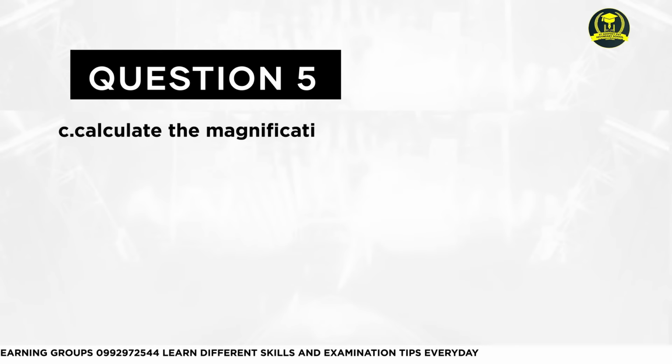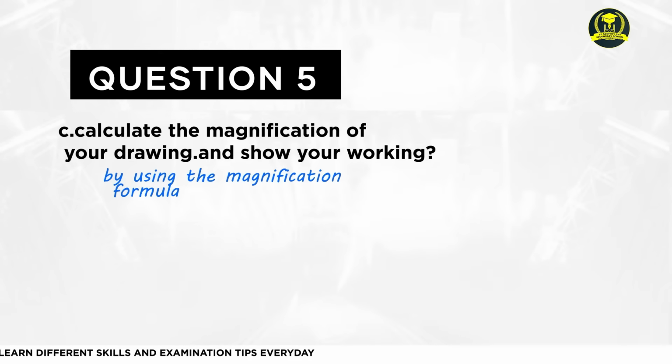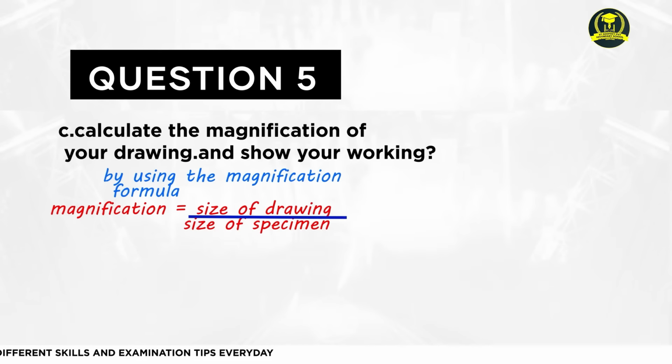Question C. Calculate the magnification of your drawing and show your working. By using the magnification formula, magnification is equal to size of the drawing over size of the specimen.